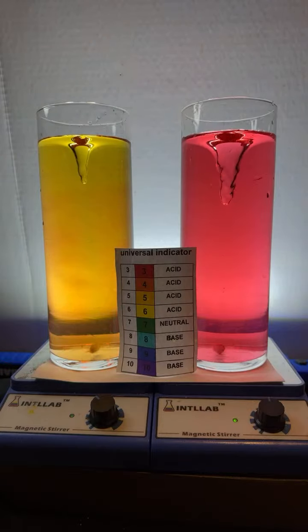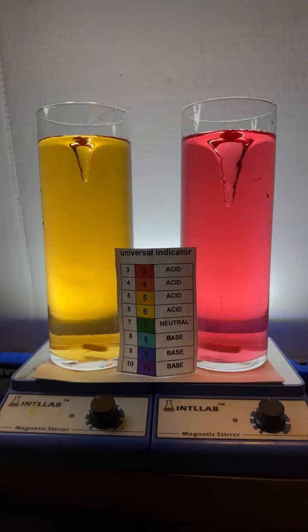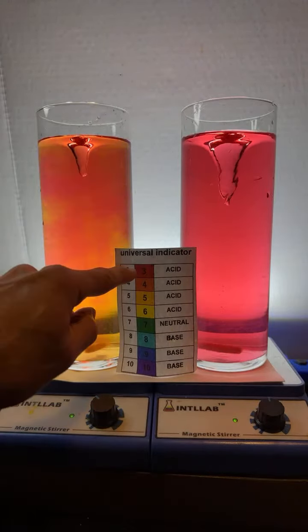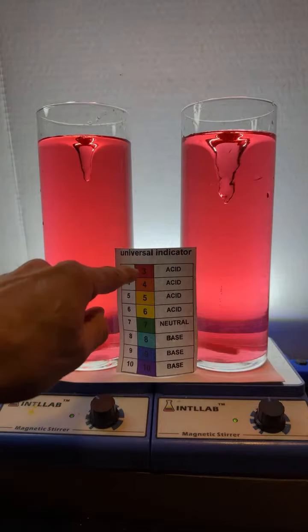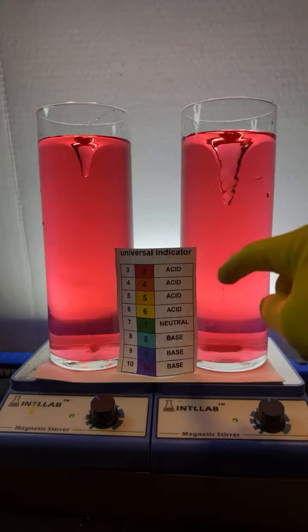Oh, nice. Here we go. I'm going to add another drop of acid over here on the left. So yeah, you can tell that right here by looking at these different colors and the different pH values. That tells you how acidic or basic the flask is. Right now we're at pH 3 or lower.